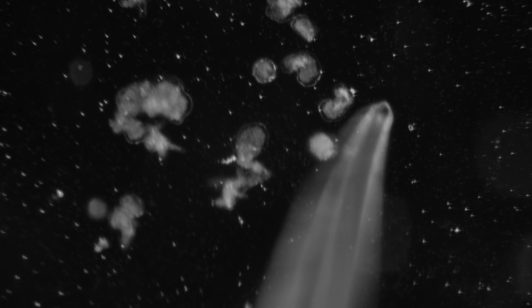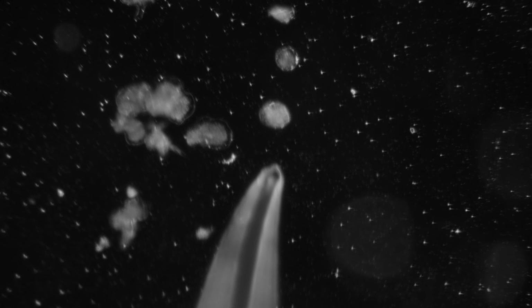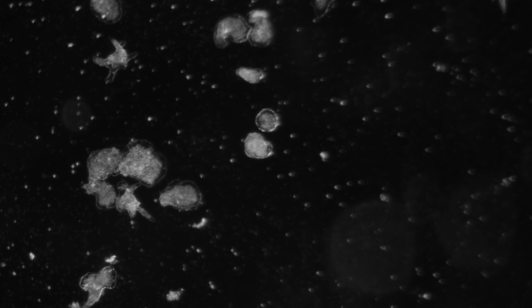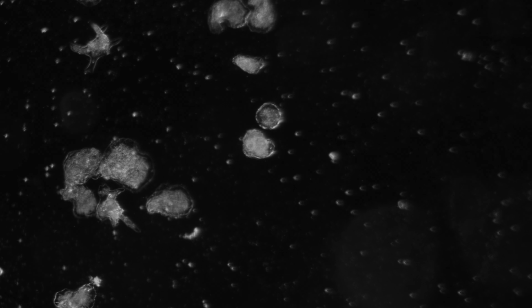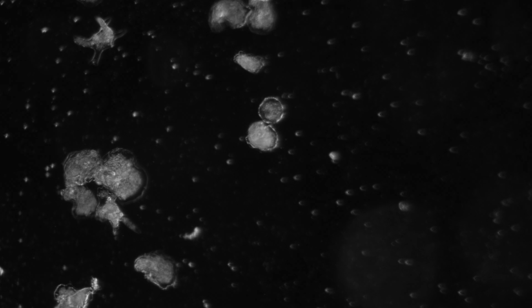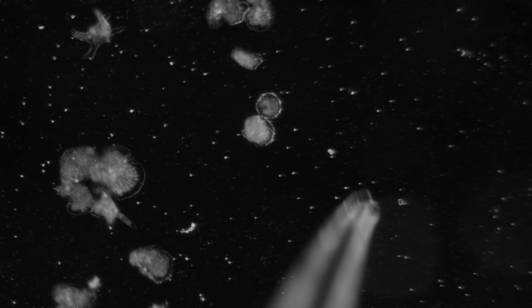And as you can see, there are two anomalies. I bring them to the middle of the frame. We have those two balls. Those balls, as you can see, are very different, and I'll have to look at them. They may be cyst candidates.